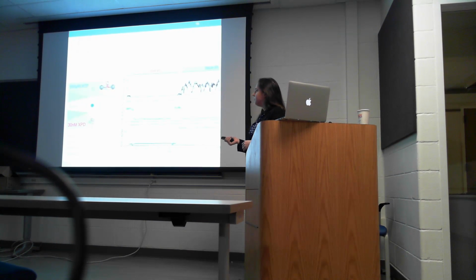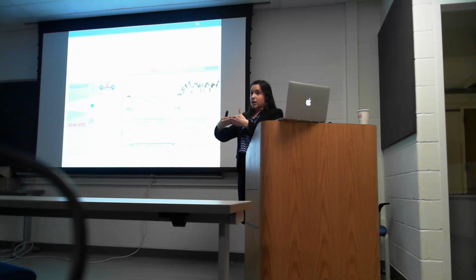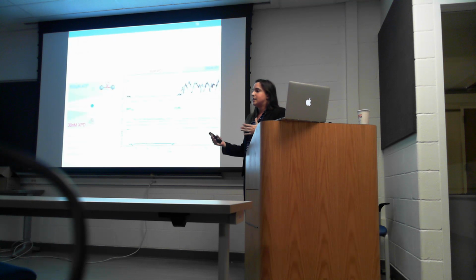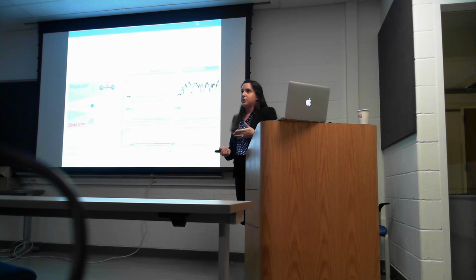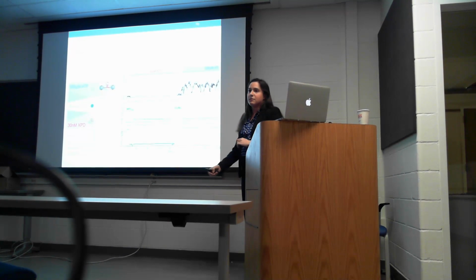And if we could shrink this, previous experiments have done XPD and ATP in completely adjacent streams so that you just instantly move from XPD to ATP. Out of an abundance of caution, particularly with using RPA, which has melting, I've added this blank channel just to know that they're definitely separated.